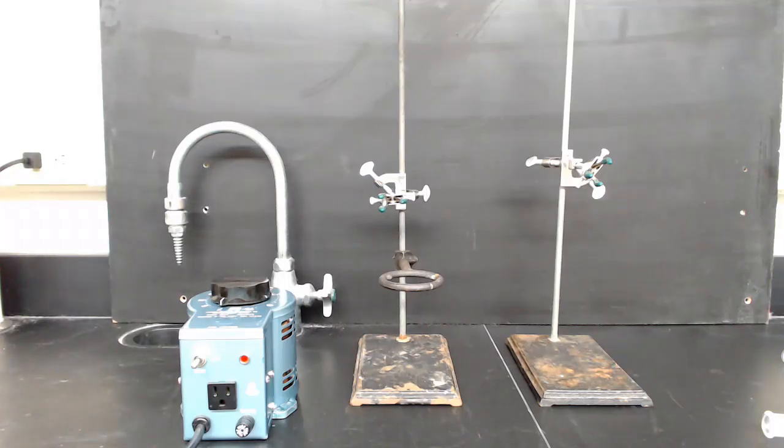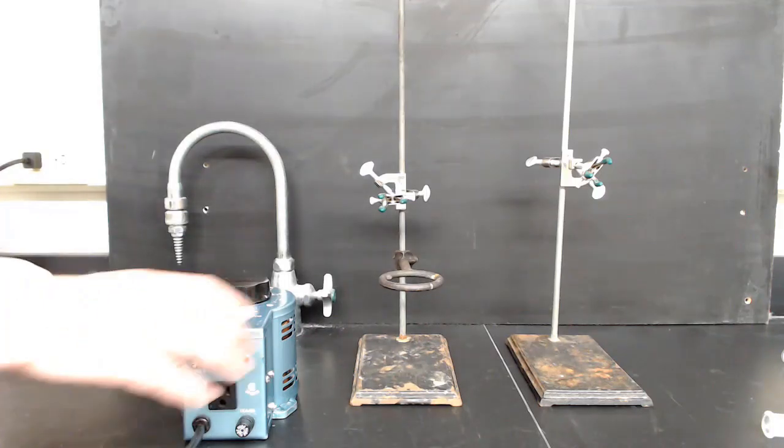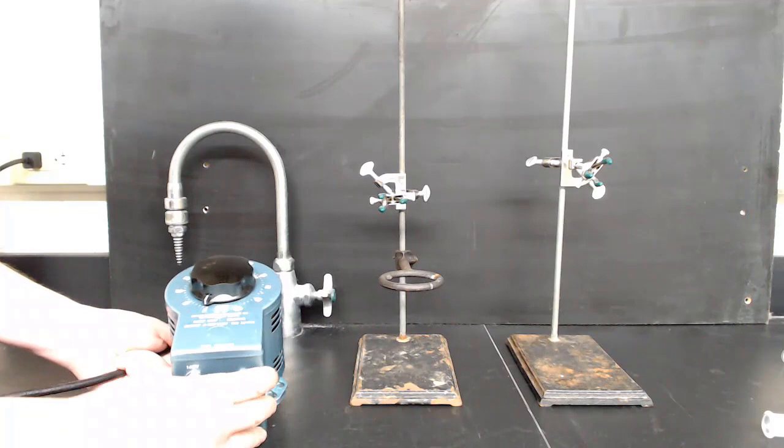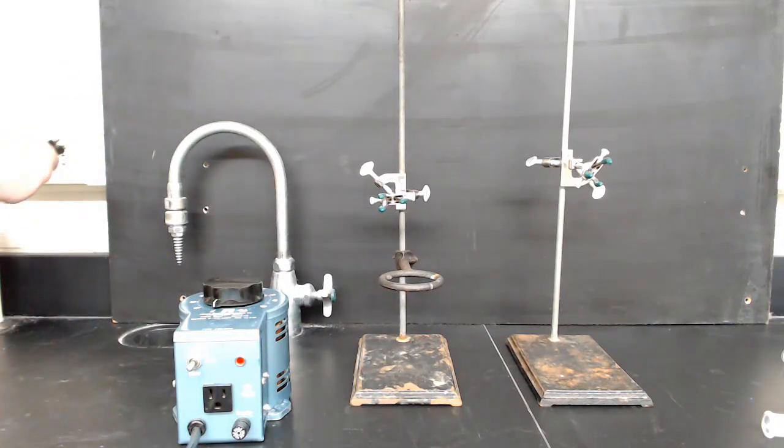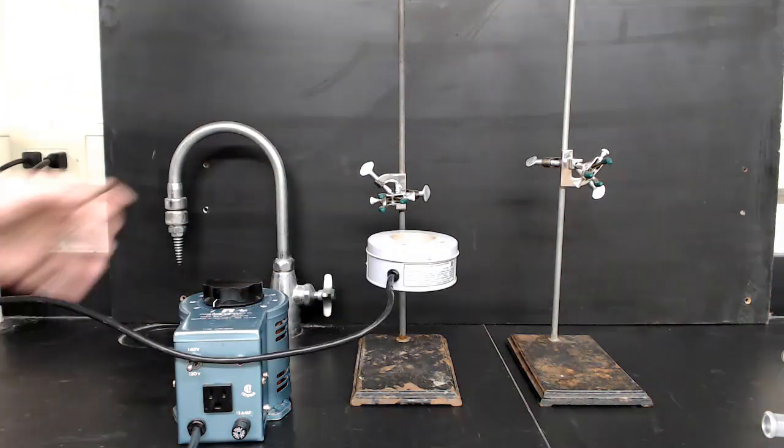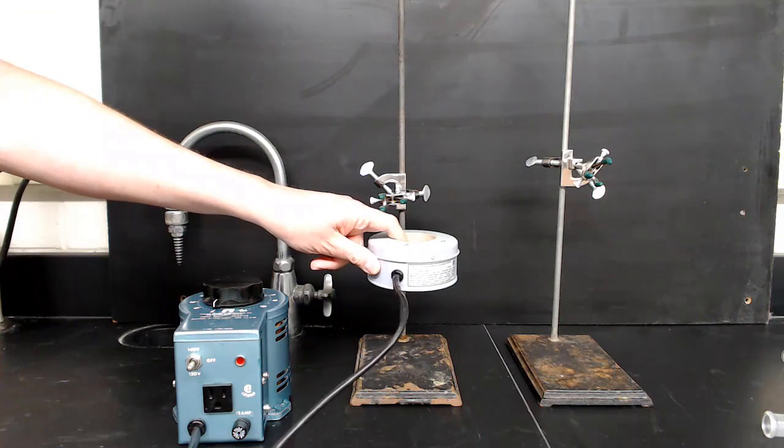Start off the experiment with two ring stands and a ring. Then, get a variable transformer like this, which has a dial that can adjust the temperature, plug it into the 120-volt wall current, get a heating mantle, and plug that heating mantle into the variable transformer.